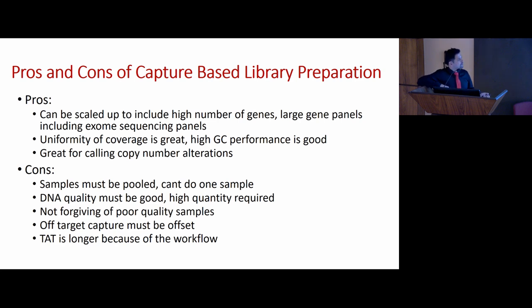You can't just do one sample. DNA quality must be good. High quantity of DNA is required. It doesn't do so great; it doesn't like paraffin fixed tissue and cell-free DNA. These are improving, but DNA quality generally must be good. Not forgiving of poor quality samples.